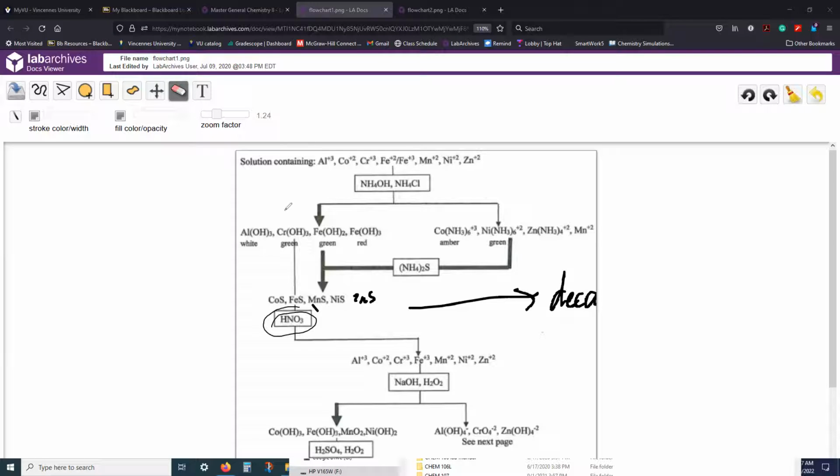The nitric acid gets all of these compounds because it is a strong acid. And we're actually going to use aqua regia as part of this as well, to get all of this stuff to redissolve. And so in the process here, we have turned all of the substances into ions again.